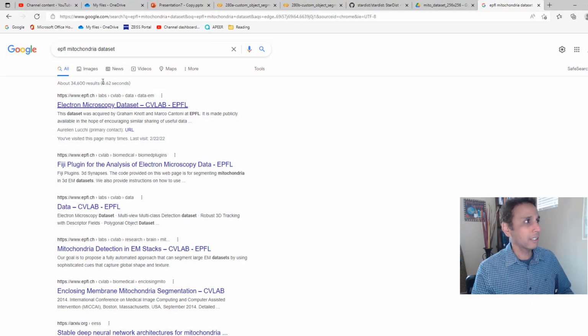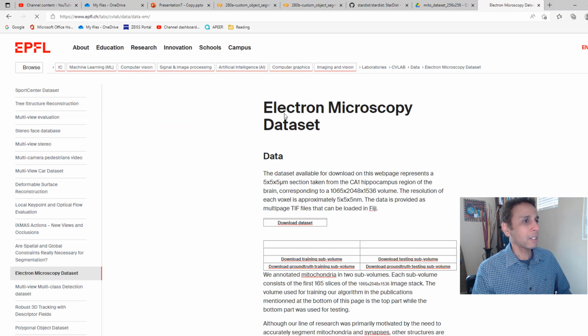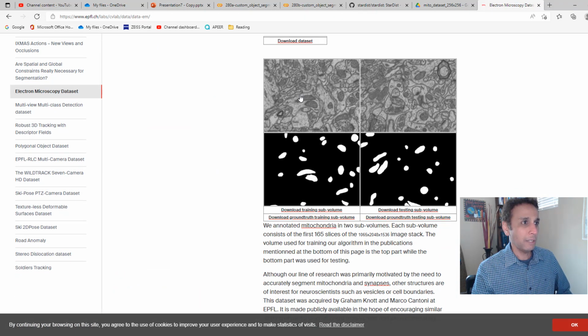I just searched EPFL mitochondria dataset, in case you want this faster. And the first link, let's go ahead and click on it. It's a bit slow. There you go. So this is the image dataset. They have what they call the test dataset, and it also comes with the corresponding labeled masks. So I downloaded this. It's about 165 images of size 700 by something.